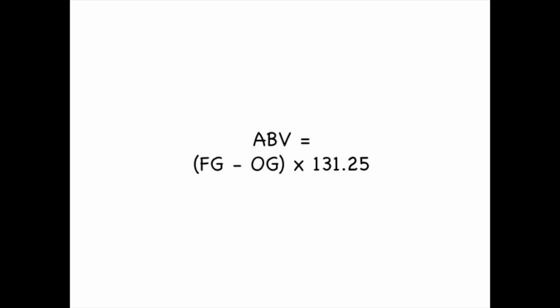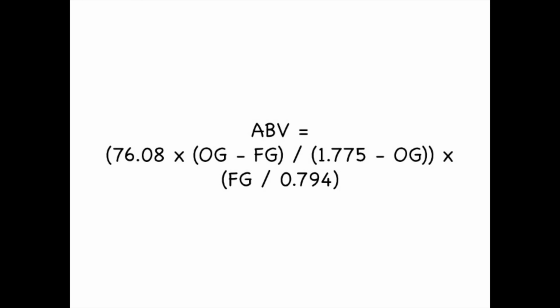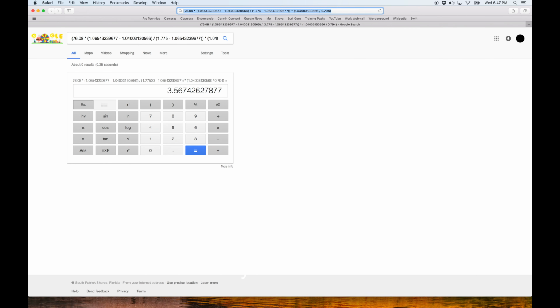Not that one. This one. It looks like this brew is a rather tame 3.6% alcohol by volume. Well, that's quite disappointing. Oh well.